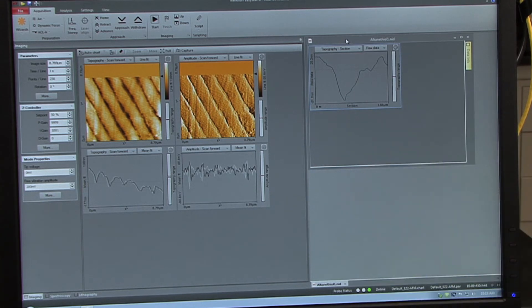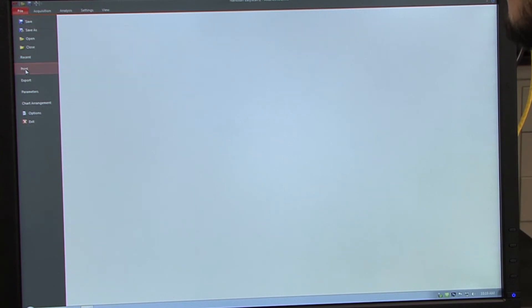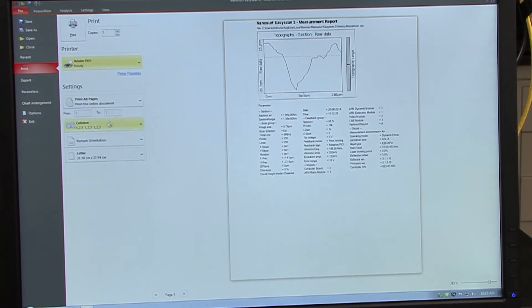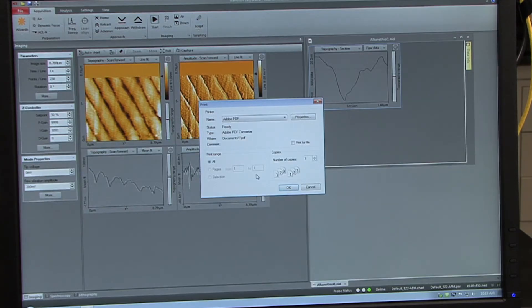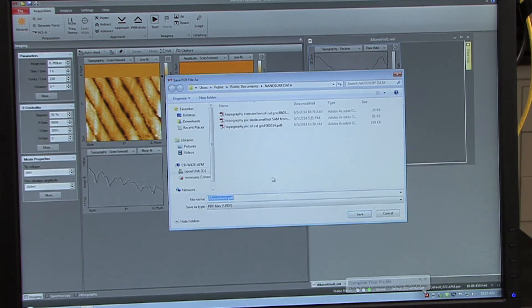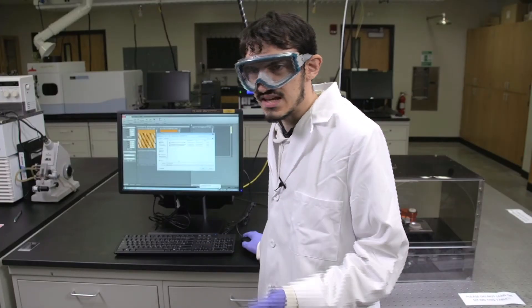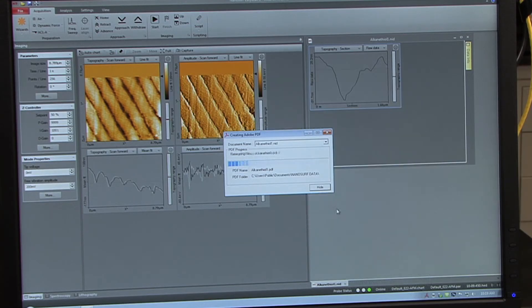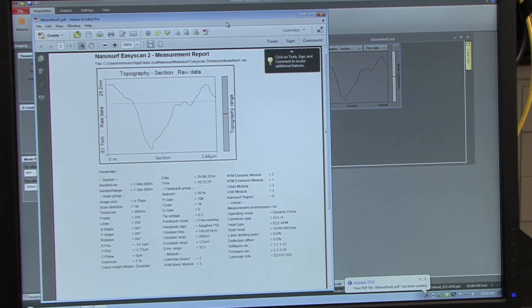Additionally, you can save the image as a PDF by going to file, print, going to printer, and clicking Adobe PDF, clicking print. And it will enable you to save the same file, but this time as a PDF image, which will then show up on the screen, along with the data itself.